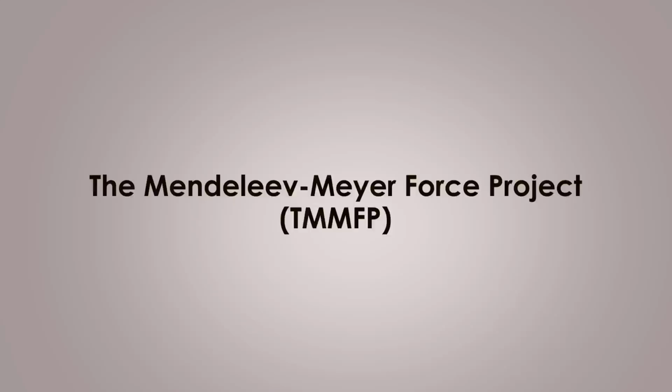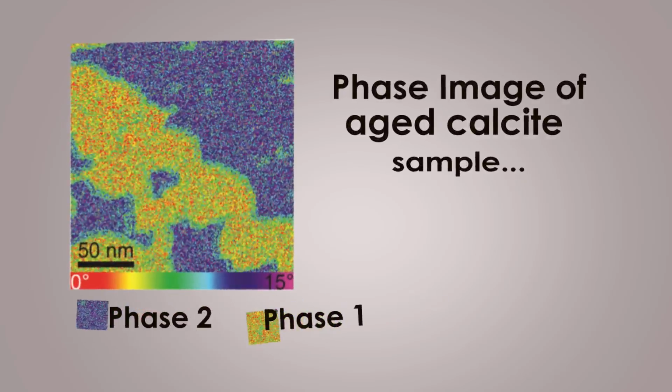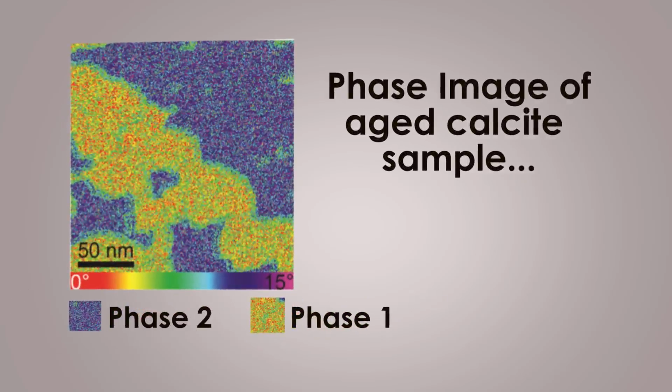In this video, I will show you a practical demonstration of how the Mendeleev-Meyer force project works. Specifically, I will walk you through the process of populating the library. I will be using a calcite sample for this demonstration.